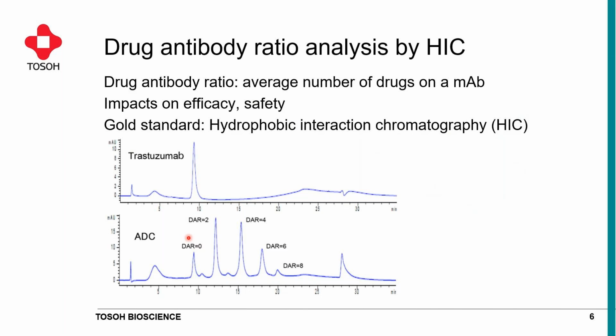What we will find in addition are sample components that elute later, meaning they are more hydrophobic and have more drugs attached to the antibody.